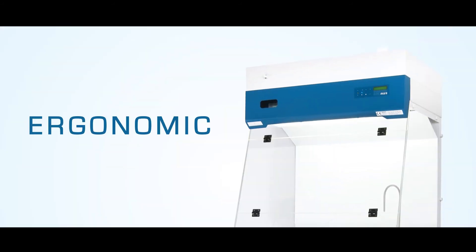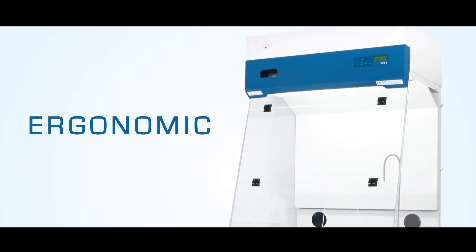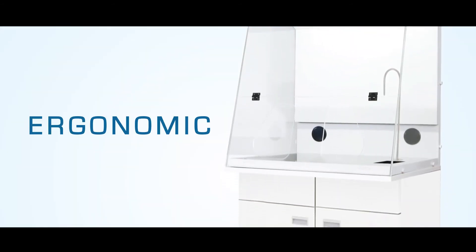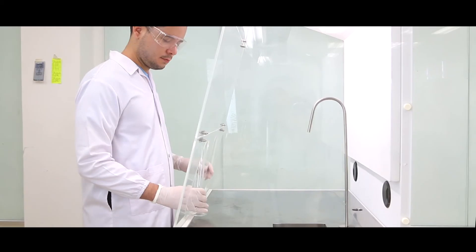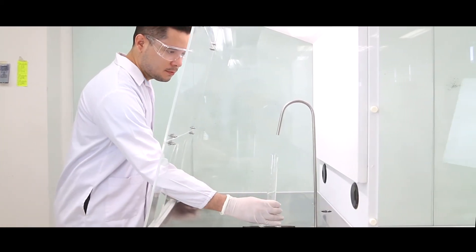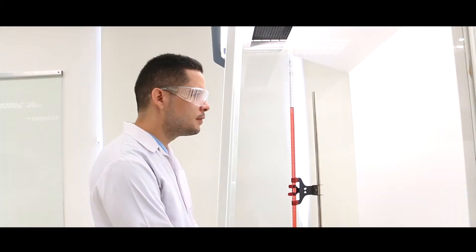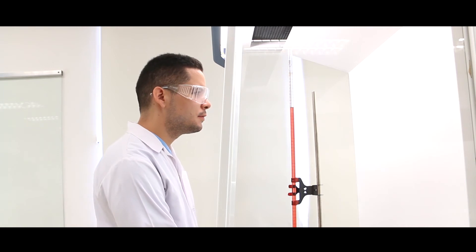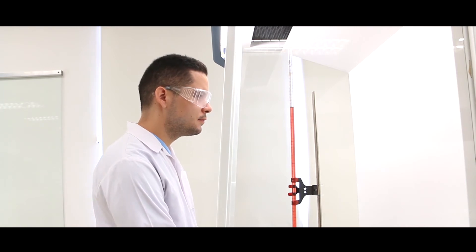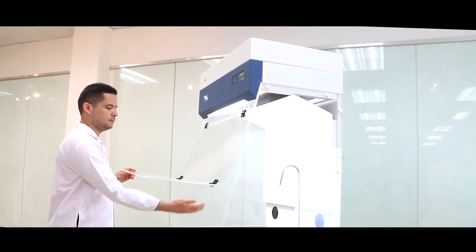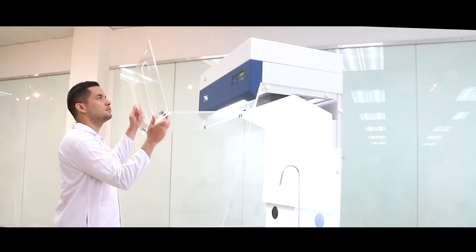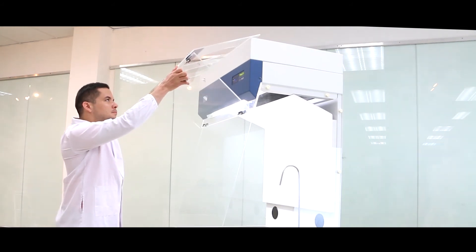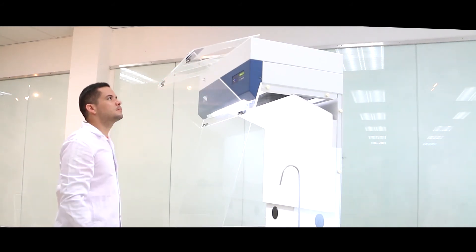The Formax has an ergonomic design with oval-shaped apertures for easy access and a 13-degree angled front sash for better visibility. It also has a double-hinged mechanism that allows higher sash opening for easy cleaning or sample loading.